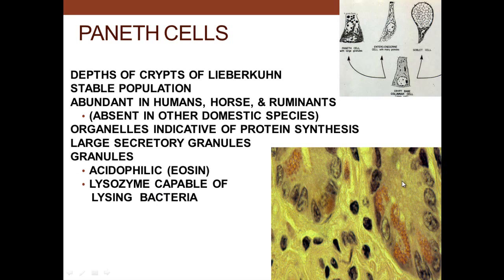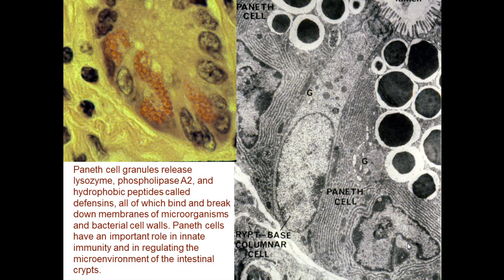So as bacteria slip down the lumen, they encounter the Paneth cells. They also concentrate zinc, another characteristic of these cells. So we can see those Paneth cells, lots of rough endoplasmic reticulum associated with protein secretion, and they discharge their content at the lumen at the bottom of these intestinal glands.